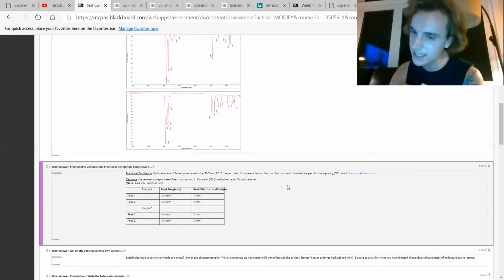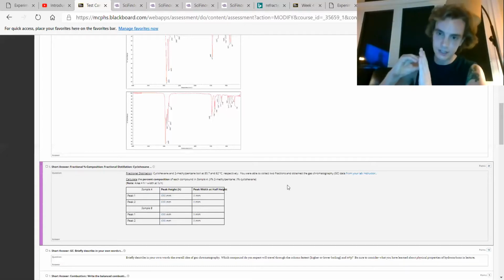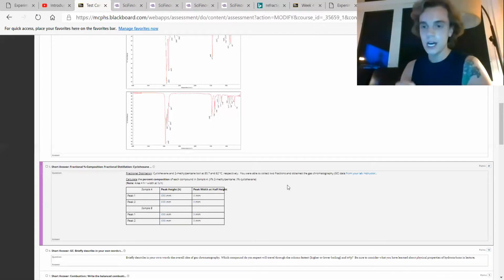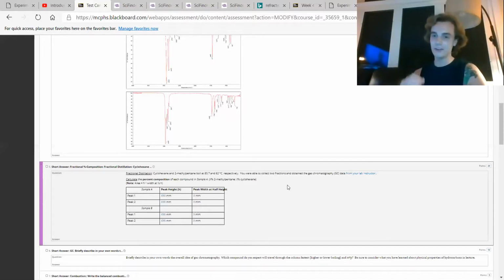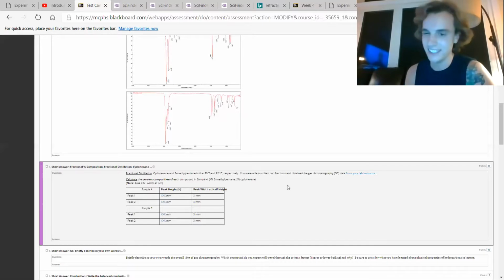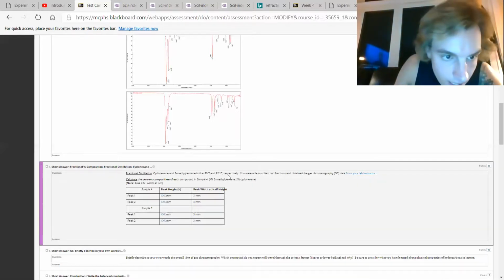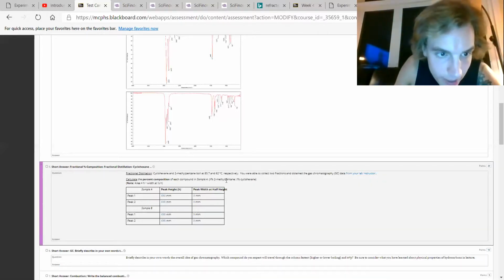Even though it's extremely slight, it does have a significant difference in which it can measure and accurately differentiate two different solvents with two different boiling points less than 40 degrees Celsius. Not less than, let's say, half a degree Celsius, but less than 40 degrees Celsius, spot on, definitely. So that, I hope, answers your question for number 5.